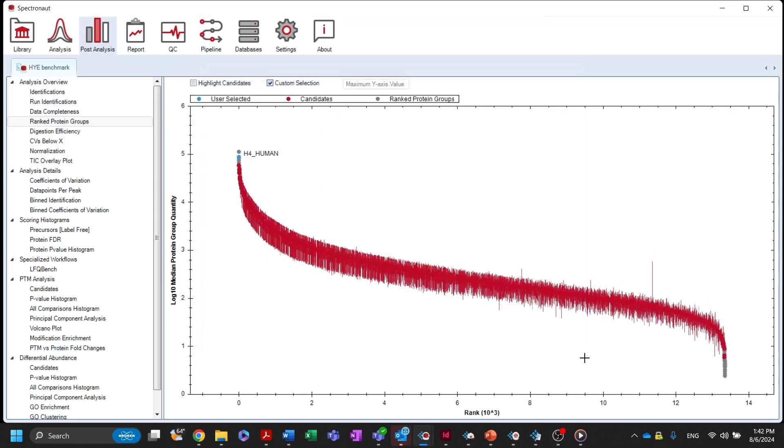The distribution of protein abundances across different experimental runs is represented by red quantitative variance indicators.